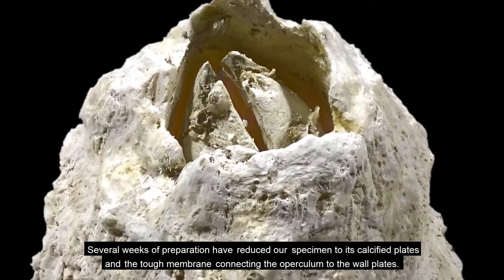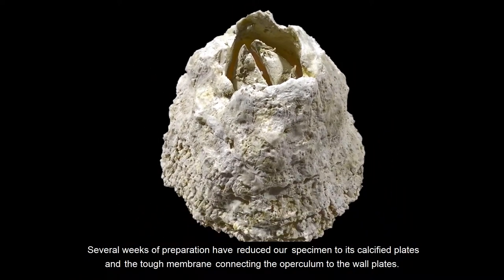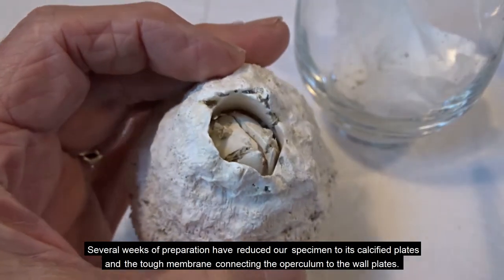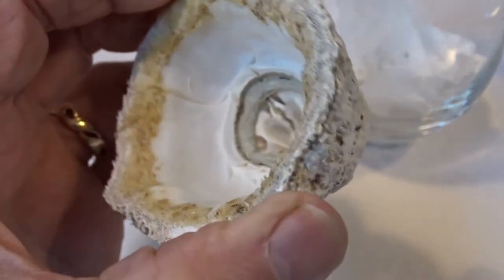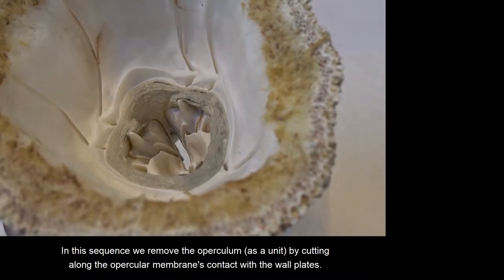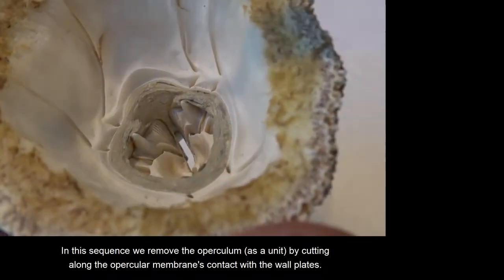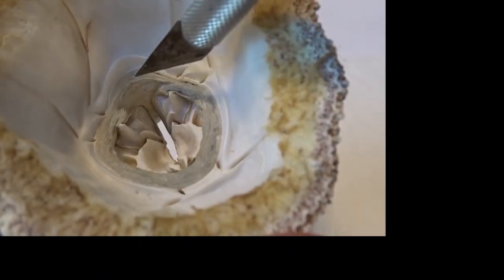Several weeks of preparation have reduced our specimen to its calcified plates and the tough membrane connecting the operculum to the wall plates. In this sequence, we remove the operculum as a unit by cutting along the opercular membrane's contact with the wall plates.